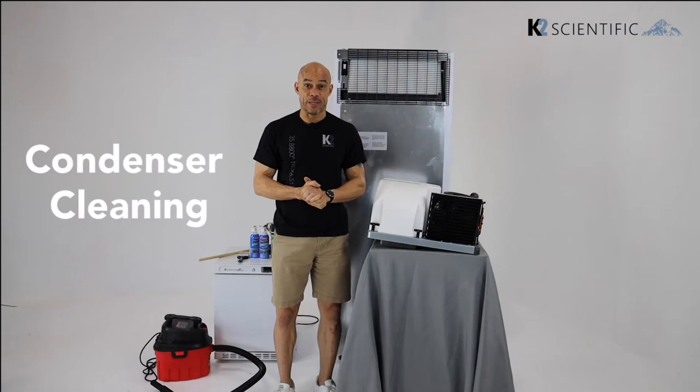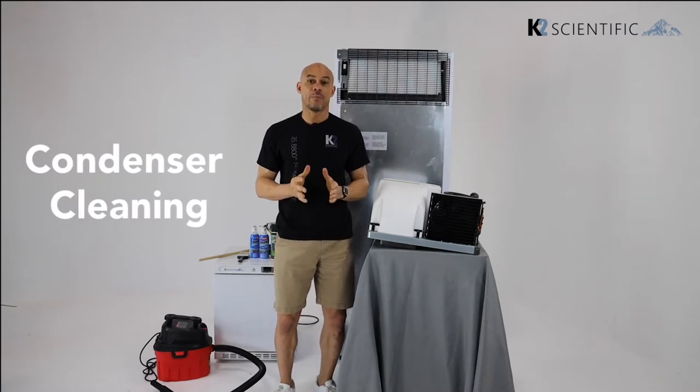Hi, this is Art from K2 Scientific. In this video we're going to talk about condenser cleaning.